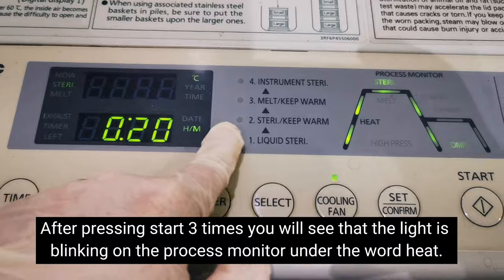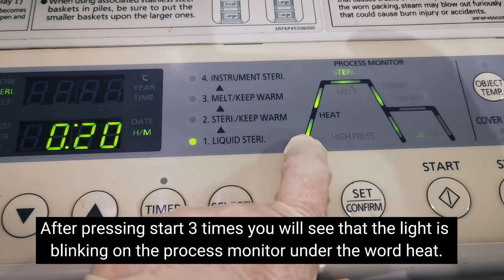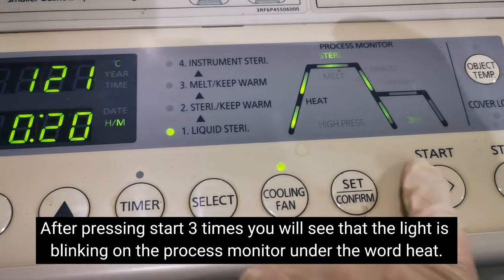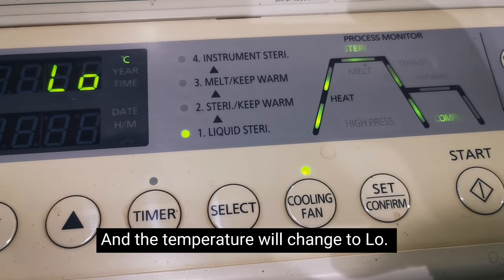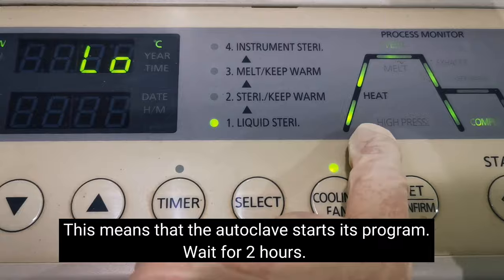Press Start three times. After pressing it three times, you'll see the process monitor — the heat indicator at the bottom will start blinking, which means the autoclave is now running.